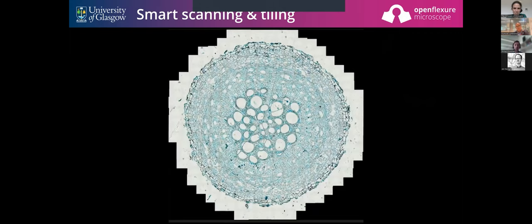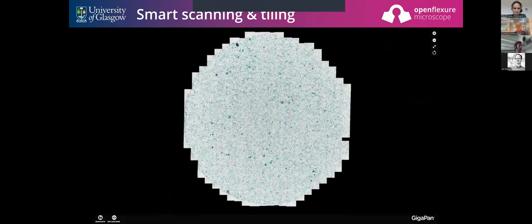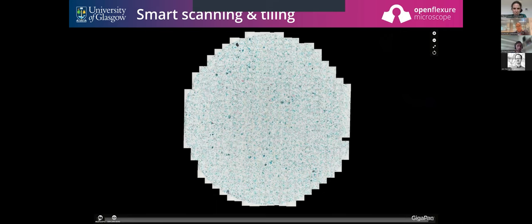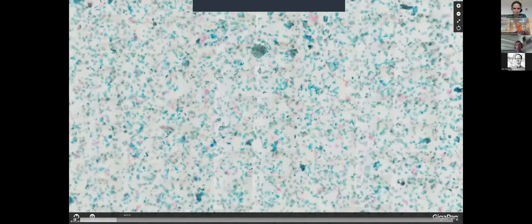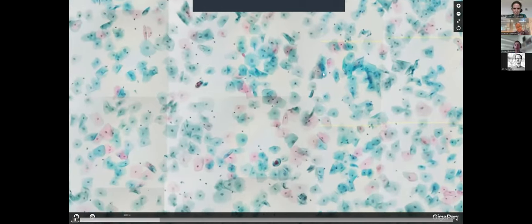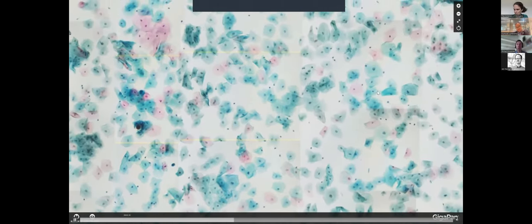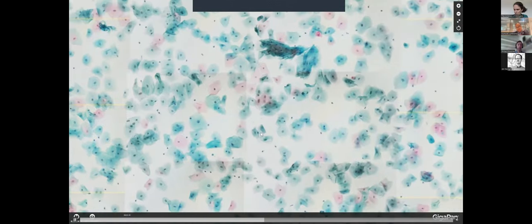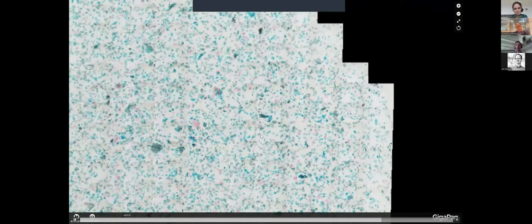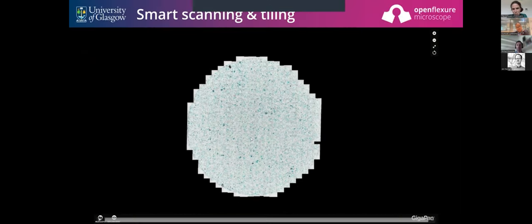The most impressive images we take these days are generally the big tile ones. This is a big pap smear — about 500 fields of view stitched together. A big advantage of the way we've built the OpenFlexure microscope is that it's very easy to automate. It can run even if you unplug your computer from it, and so it's perfect for taking these great big scans. That's where a lot of the possible diagnostic uses of the system come from.